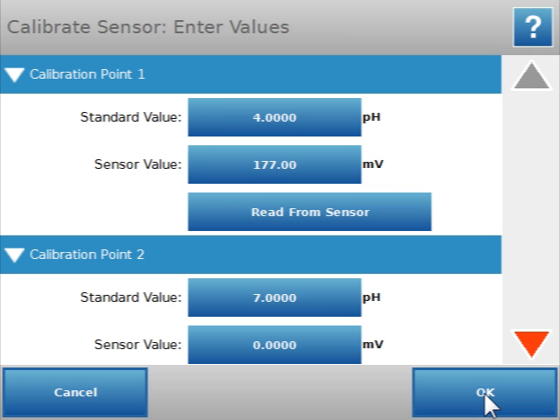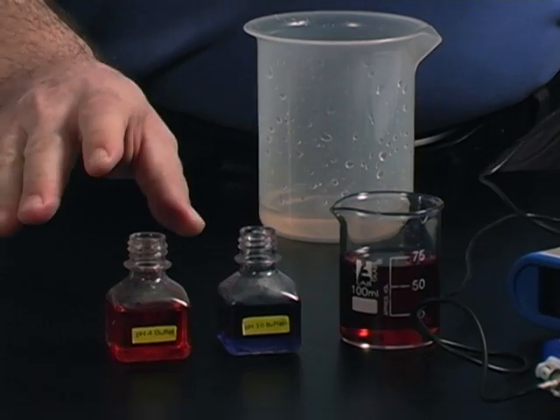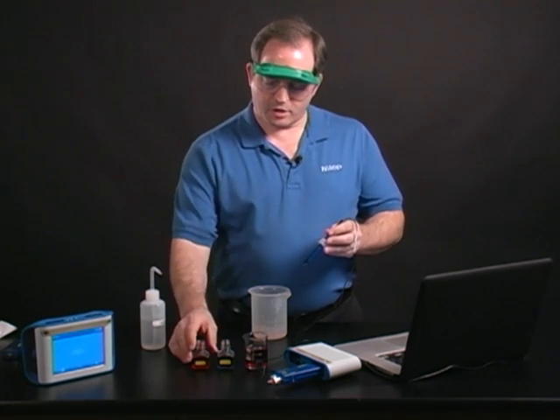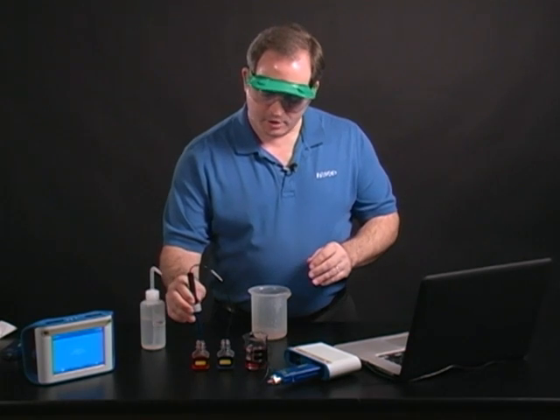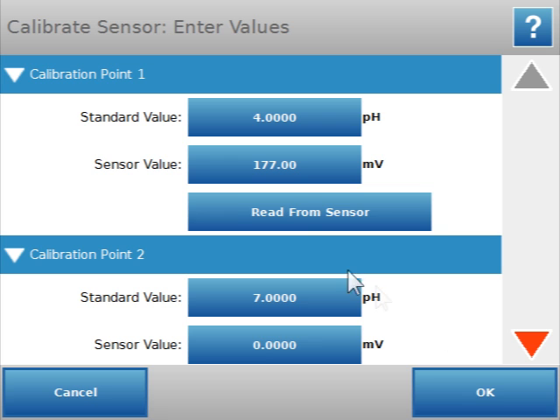You'll see it automatically comes up with the two points shown. I'm using a 4 buffer and a 10 buffer. It's set up with 4 and 7 by default, but we can change that. I'll start with the 4 buffer. I'm going to take the probe, stick it into the 4 buffer, and read from sensor. That will take a value from the sensor and associate it with pH 4.